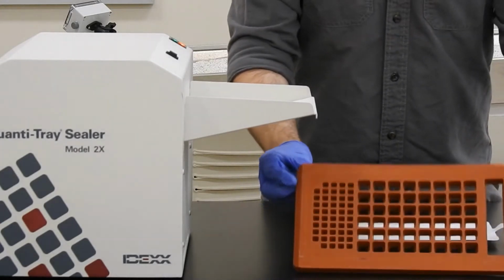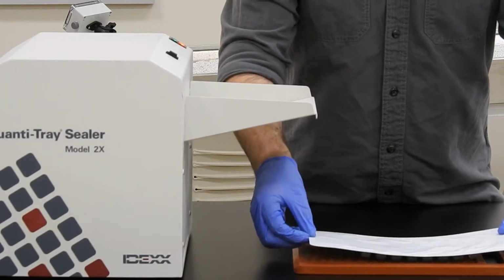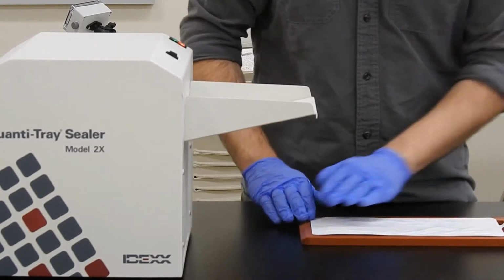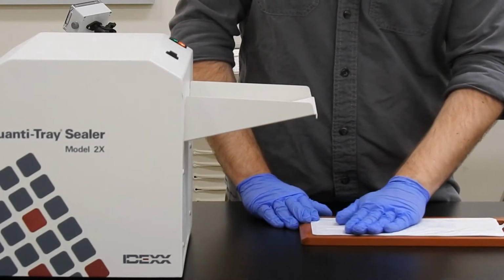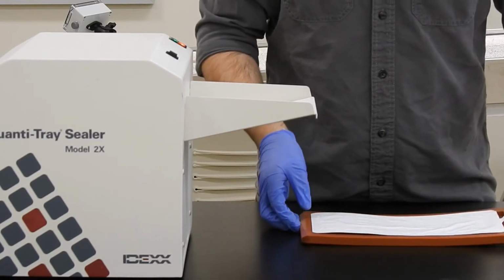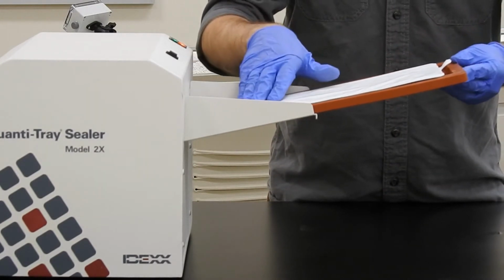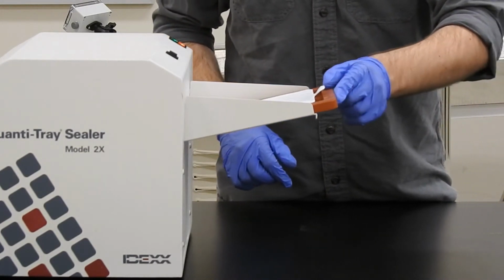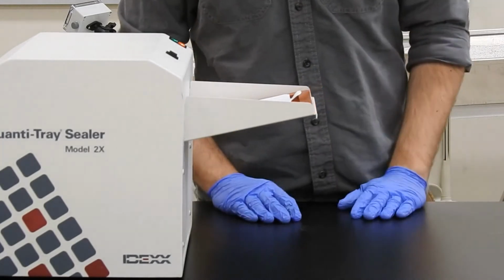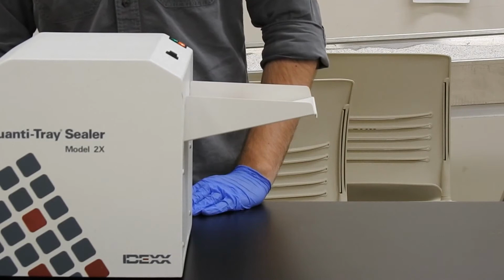So once you have that water distributed, you're going to set it on this rubber tray, and then we're going to pass it through the sealer. That's to close the tray and make sure that it's sealed off to the outside environment. Again, you can see me smoothing it out one more time, and then putting it into the sealer. The sealer that we use doesn't always take them perfectly, so you'll see me shake my hand there to get it kind of locked in. And then it passes through, and then simply comes out the other end.